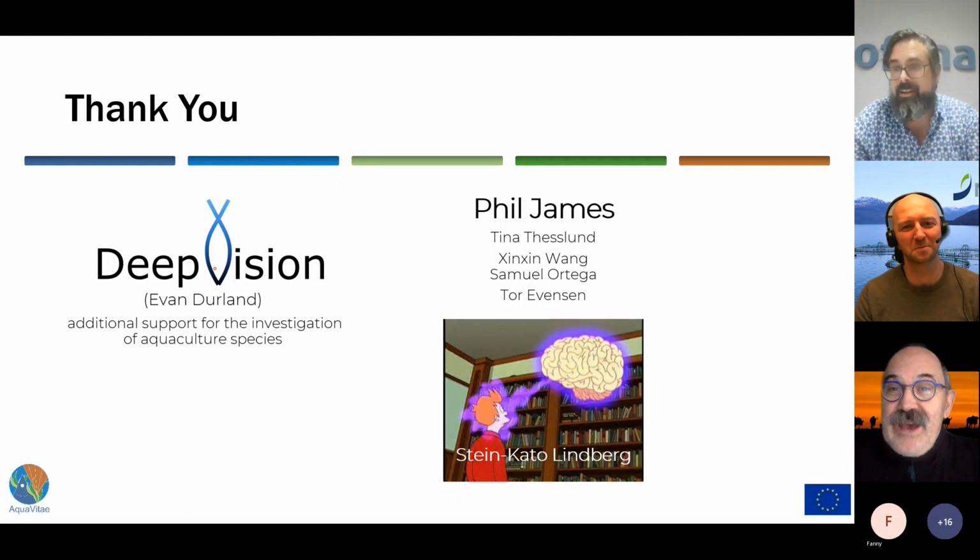As you're rich and you have a hyperspectral camera, did you try to excite at longer wavelengths? Because you limit yourself to the UV, blue, deep blue, but going higher up, you get other fluorescences perhaps. And as you have the camera to measure it.